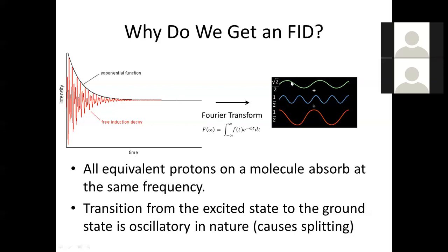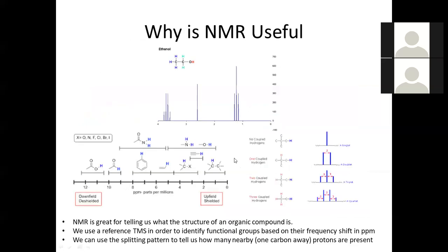We're saying, okay, this is one axis, this frequency of wave is another, this frequency of wave is another. How much overlap is there between them? So essentially we're doing an infinite number of dot products is what this mathematical function is doing. It's checking the projection onto each frequency wave of this entire thing. And that's useful because frequency is directly proportional to energy, right? So we can compare the energies now, and we're able to do all of the wavelengths at once because of this Fourier transform.